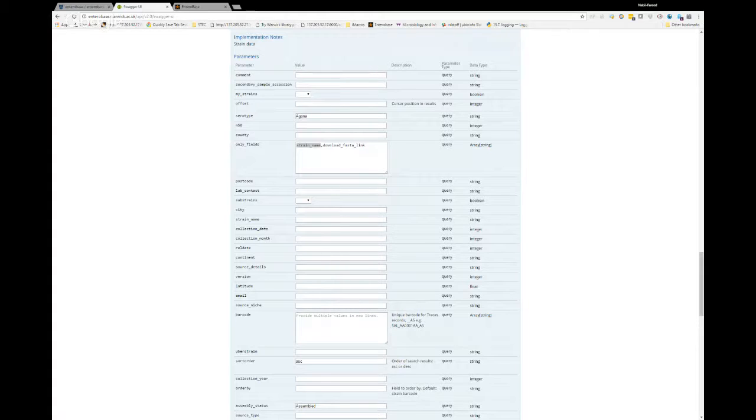At the moment, we've spoken to a lot of organizations about trying to develop an ontology for describing a strain's host or source or other clinical data and metadata as such. It's an ongoing effort to try and put that together.